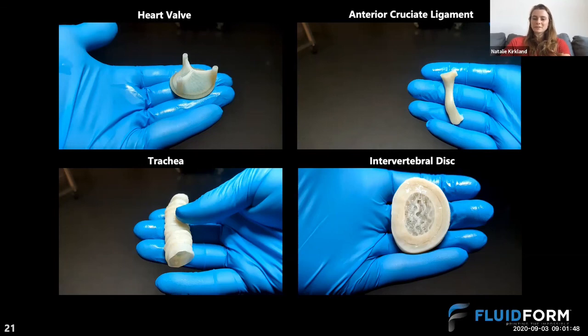Thanks for an interesting talk. For printing orthogonally gelling materials simultaneously, can different inks be injected from separate nozzles? Also, if multiple gelators are added within a single ink, can uncross-linked components be removed following gelation?